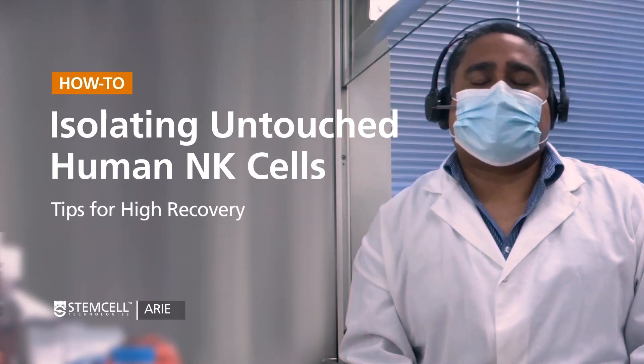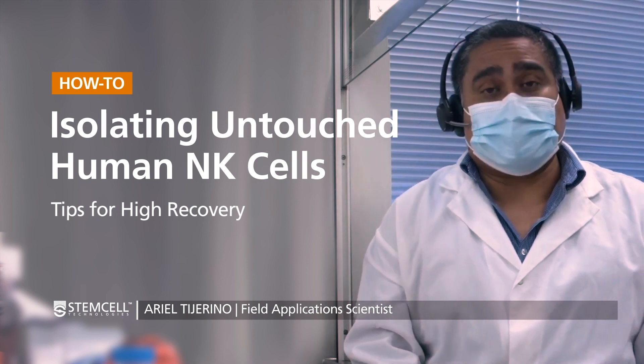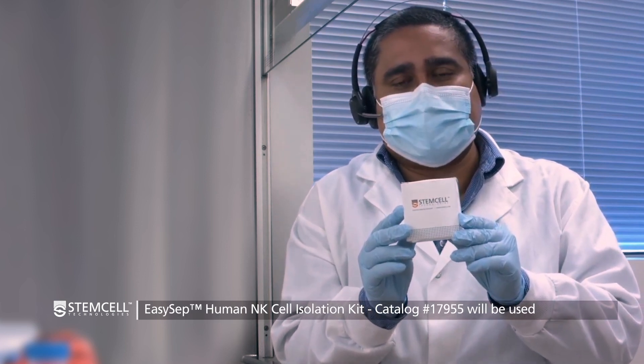Hello everyone! Today we're going to be going over human NK cell isolation. While there may be many different workflows to obtain human NK cells, in this video we'll be using the 17955 negative isolation kit, which is designed to start from mononuclear cells.